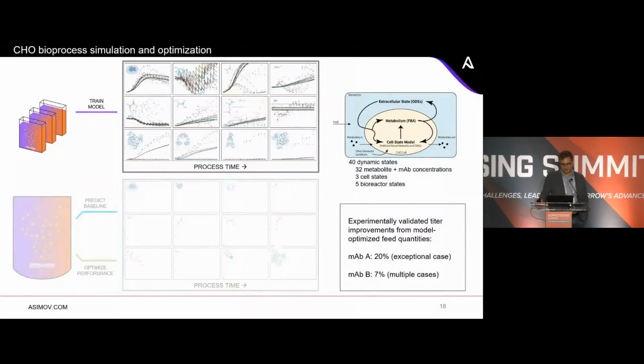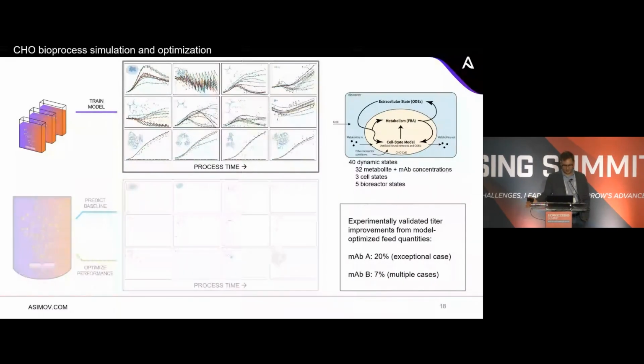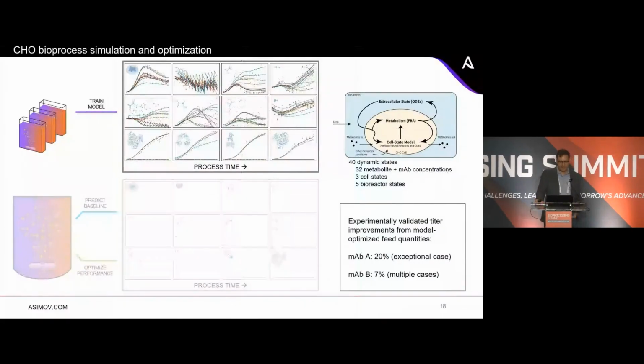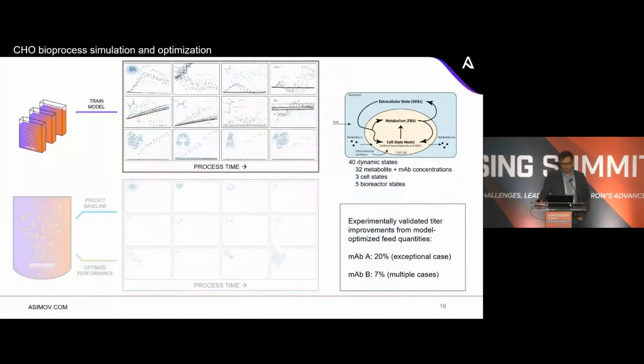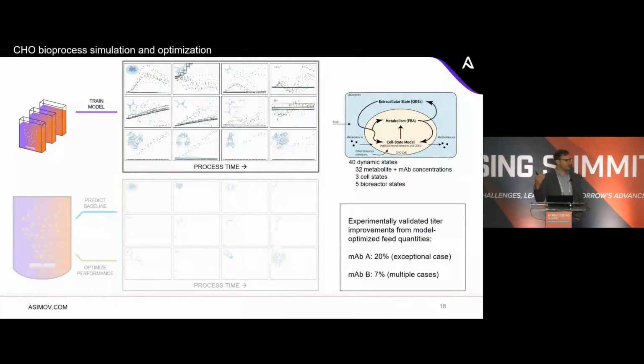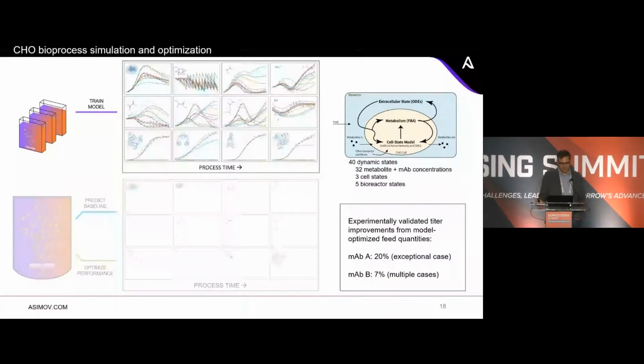And then we have glucose, and I believe lactate, ammonium, pyruvate, alanine, glutamine, pH, I think, represented here. And then on the bottom, 4 different mAbs. And you can see that as we train the model to learn its parameters, it will begin to recapitulate the experimental data quite faithfully.